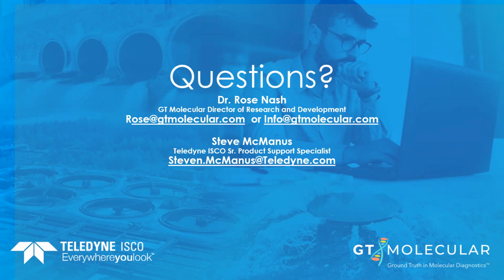Sure. So great follow-up, because this is a very similar question to the last. So it does require shipping on ice packs. We like the samples to stay close to 4 degrees always. It doesn't require refrigeration, but we ship the kits with an ice pack in them. Upon receiving the kit, the ice pack is stored in the freezer for 1 hour, and then it's going to be at 4 degrees. And that shipping arrangement that we've put together is validated to keep the sample at 4 degrees for 48 hours. So even though it takes 24 hours, there's that extra day of buffer just to be careful.